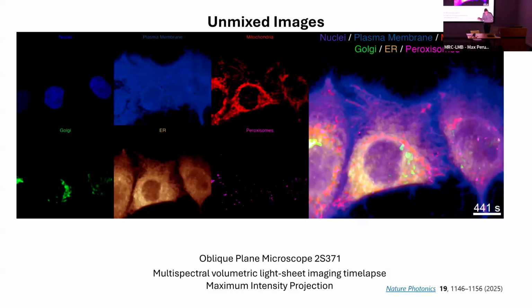So why is this interesting? Well, this is in some respects a demonstration of what you can do. We often talk about proteins by their position in a pathway, and proteins that inhibit and cause reactions, turn things on, turn things off. When you do this sort of multi-scale, multi-channel imaging, you have the chance to look at things all together, all at once, because oftentimes the experiments are done pairwise.